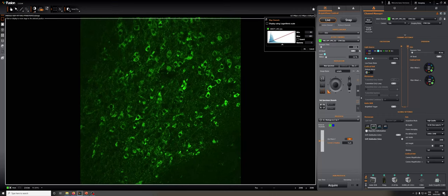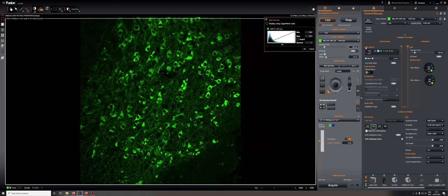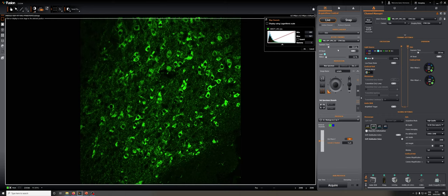A good way of checking how much exposure one needs is by doubling the exposure and seeing if that doubling results in an increase in quality that is beneficial for whatever analysis you're going to do. You can see as I cycle up, I can see improvements in the quality, and at some point those improvements become hard to notice or maybe irrelevant for a typical analysis.